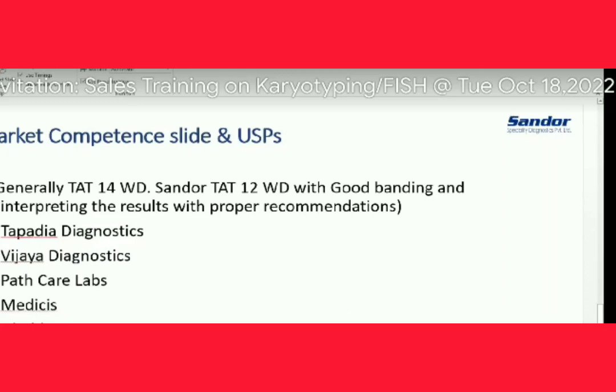As you said, we should not take a sample if the patient is on antibiotics. Is this applicable only for blood samples, or for other samples like fluid or POC also? No, I'm talking about blood samples only, not the prenatals. Only for postnatal, I am talking. Postnatal only it will affect. Prenatals, definitely the patient will be on antibiotics only. Clear? Yes, sure. Thank you.